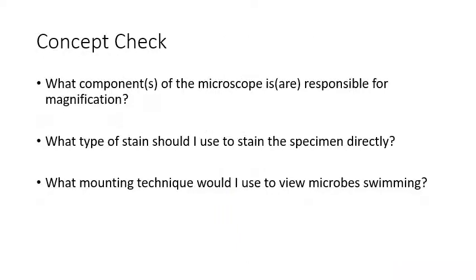All right, a few questions here before we wrap up. So, what components of the microscope are used for magnification? What type of stain should I use if I'm going to stain a specimen directly? And what mounting technique would I use to view microbes that are swimming, so alive and swimming?